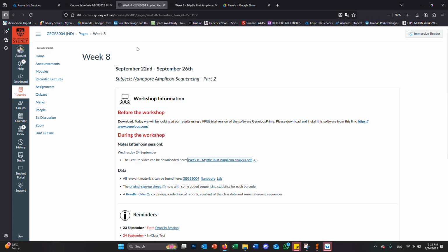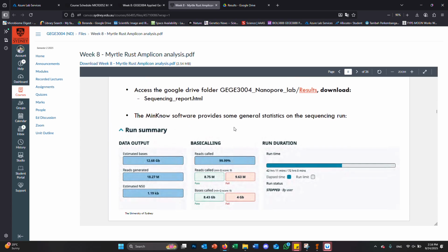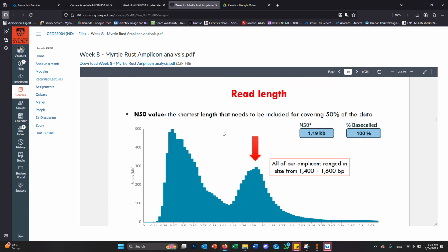Scott, would you reuse a cell like this with 400 active pores at the end? You've got something that after 42 hours we're sort of down here below 500. That's not sharing. Oh, I can see it on these screens.